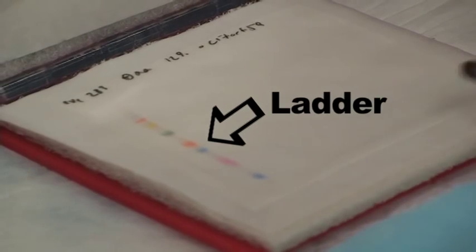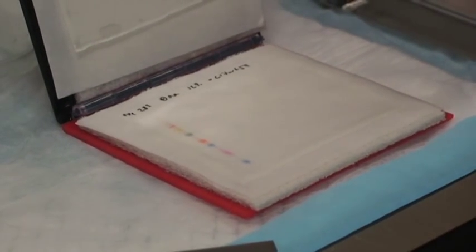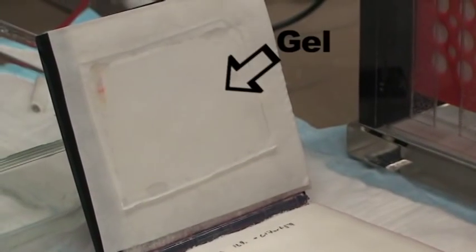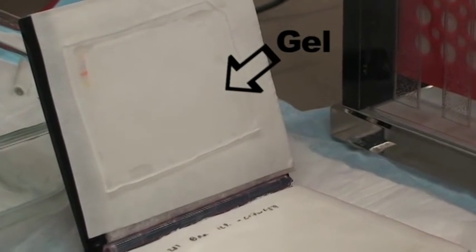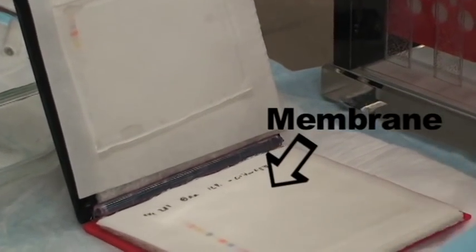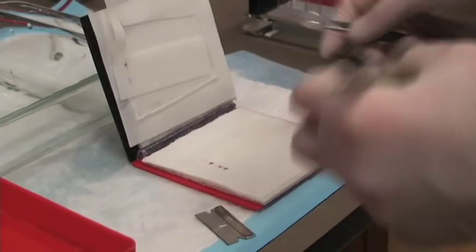Seeing that the ladder has transferred to the membrane is one of the ways we know our transfer step worked. Each of those colors in the ladder represents a different protein of a known size, so we can compare our protein samples to the ladder.